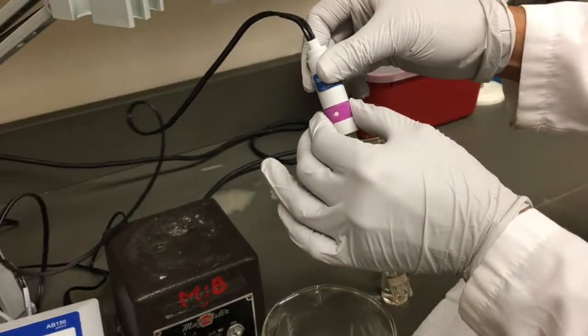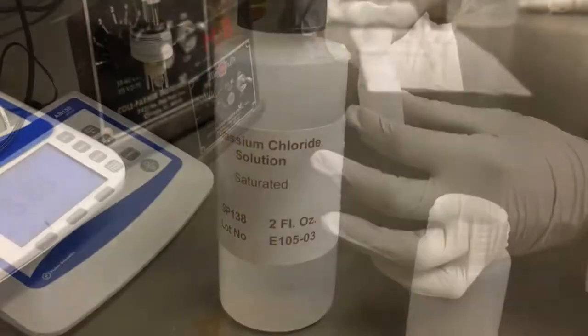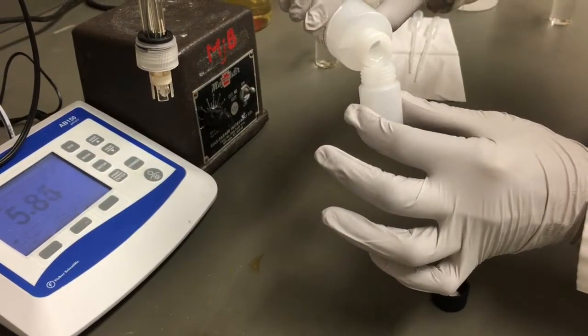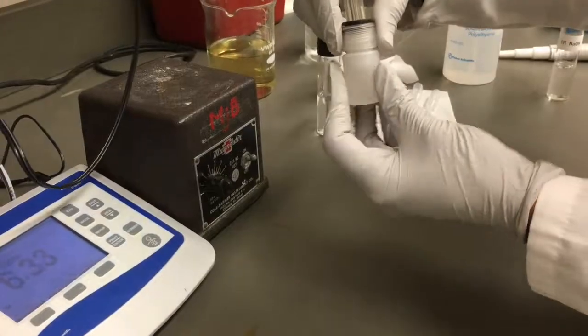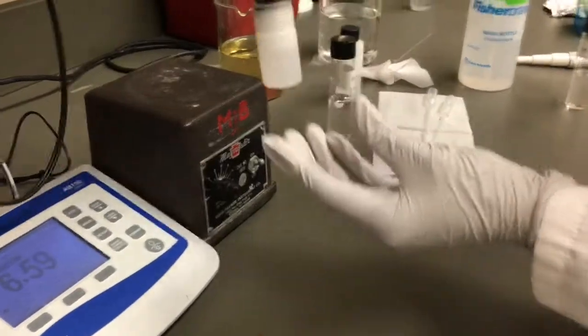As our storage solution, the 4 molar potassium chloride, was getting low, we will refill the bottle so the tip is completely submerged. Carefully replace the bottle over the probe so as not to crush the tip.